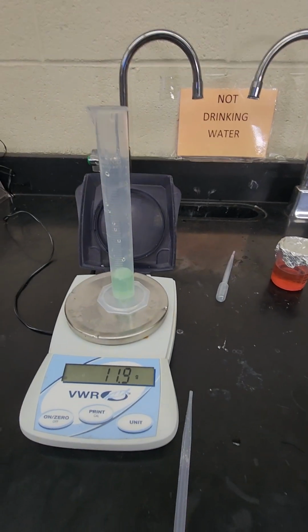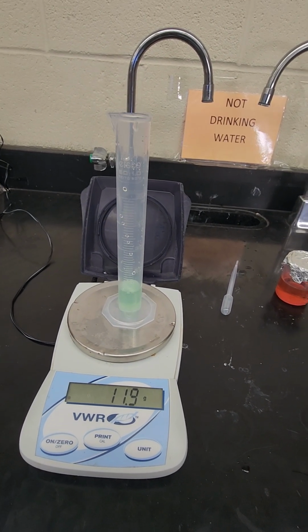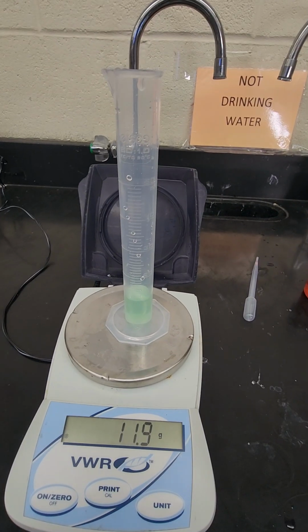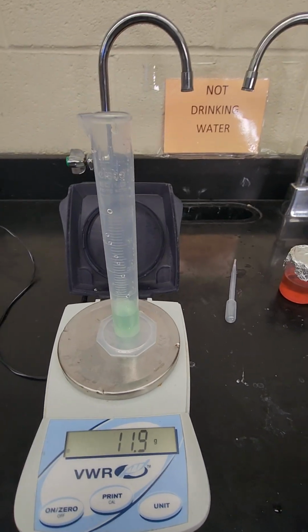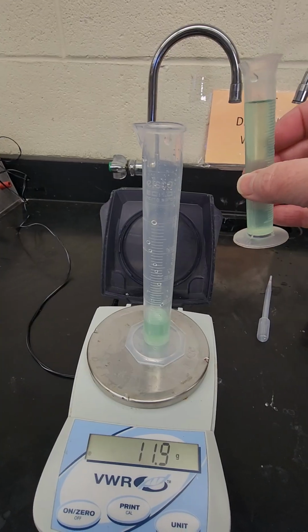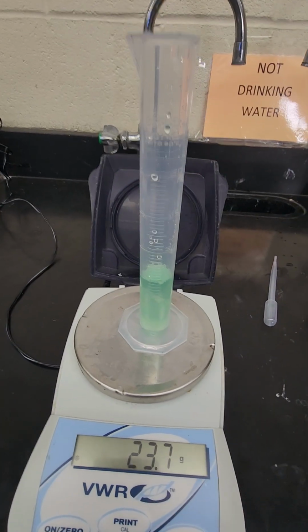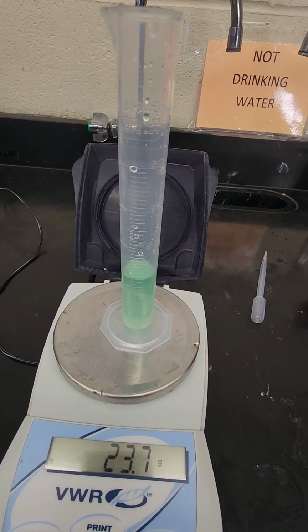Okay, so now we're on the last liquid. This is the green liquid. This is salt water, so you're going to want to write that down. I've already poured 10 milliliters in, and the mass for 10 milliliters is 11.9 grams. I have another 10 milliliters for a total of 20 milliliters. I'm going to pour it in, and now my mass for 20 milliliters is 23.7 grams.